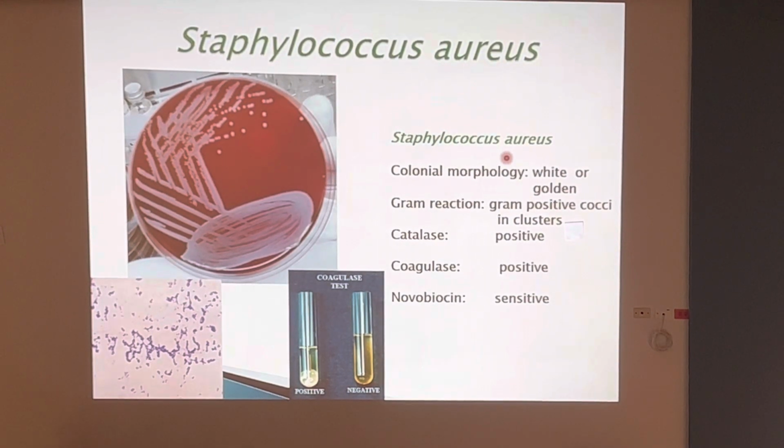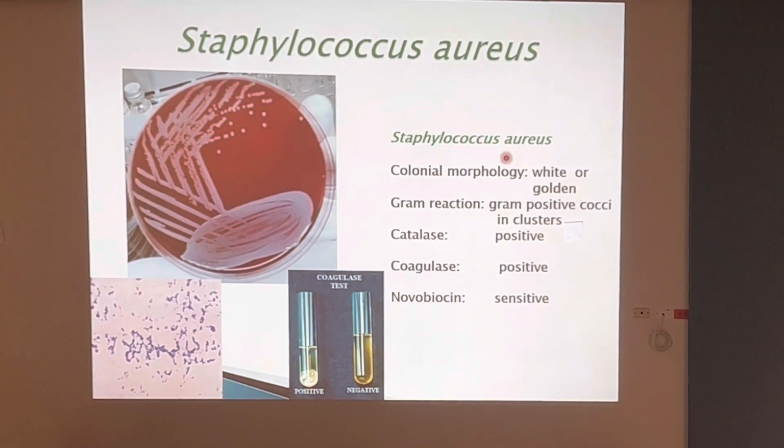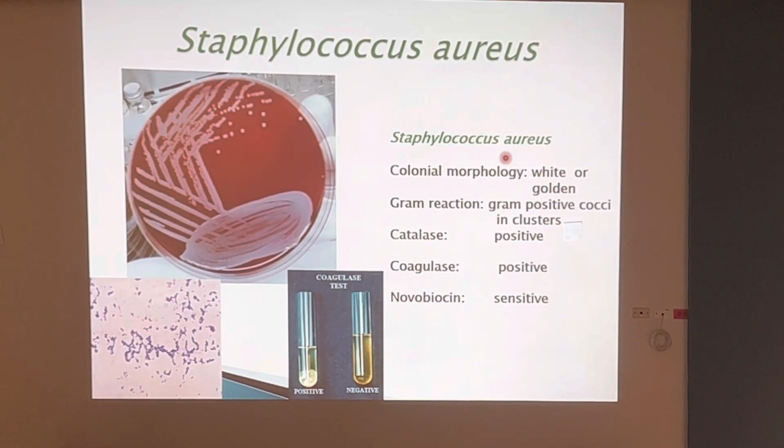After obtaining such a gram stain result, I performed the catalase test. My catalase test is positive. What does that tell me? It is a staph. Now I need to decide which staph species it is. It can be either aureus, epidermidis, or saprophyticus.